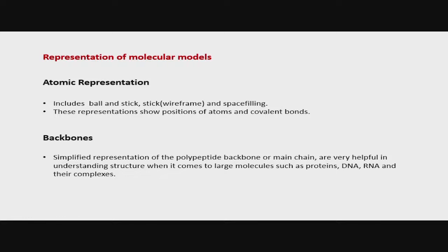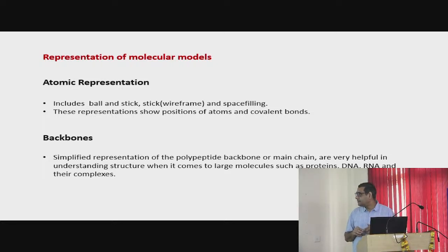This is also very good because when you work on long peptides, long proteins and other chain based molecules, like monoclonal antibodies or immunoglobulin, you have to see all those backbone structures. And when you talk about backbone structures, you have the opportunity to understand various types of proteins, not only one type. You can see many types of proteins, and the template of the target protein where you are working is also available, so you can compare your structure with that particular protein.